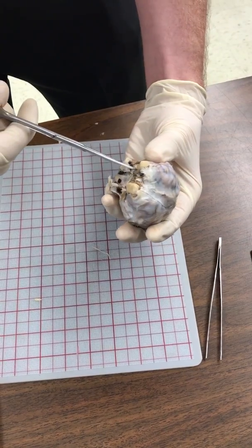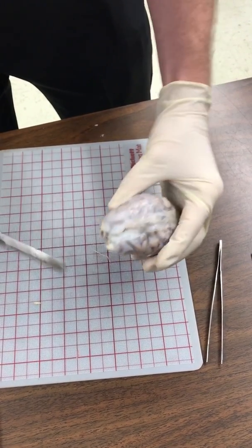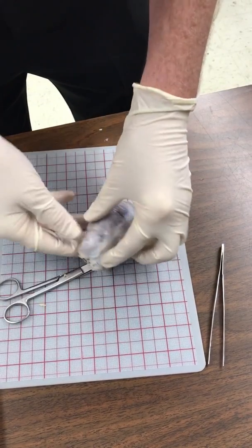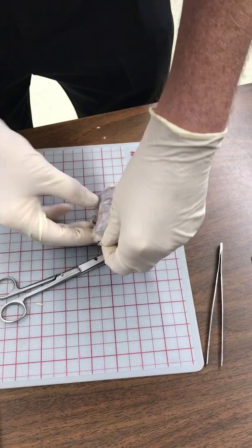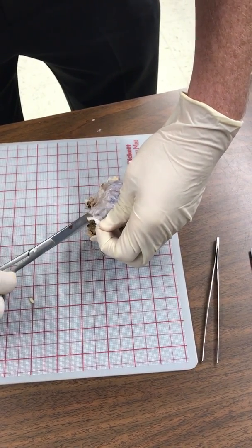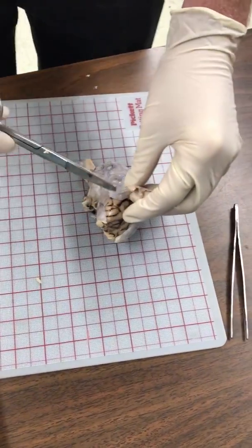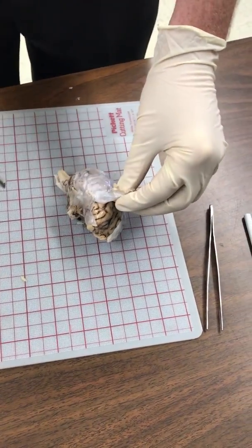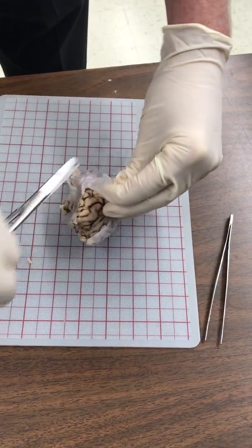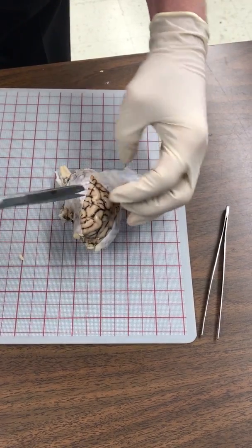We don't want to go too deep into the brain because we don't want to cause damage to the brain. I just made a cut there and it's already coming right off, so we're going to go ahead and remove the top. I'm just going to cut it into pieces so it's easier to manipulate the dura — cutting alongside there and moving that top section.